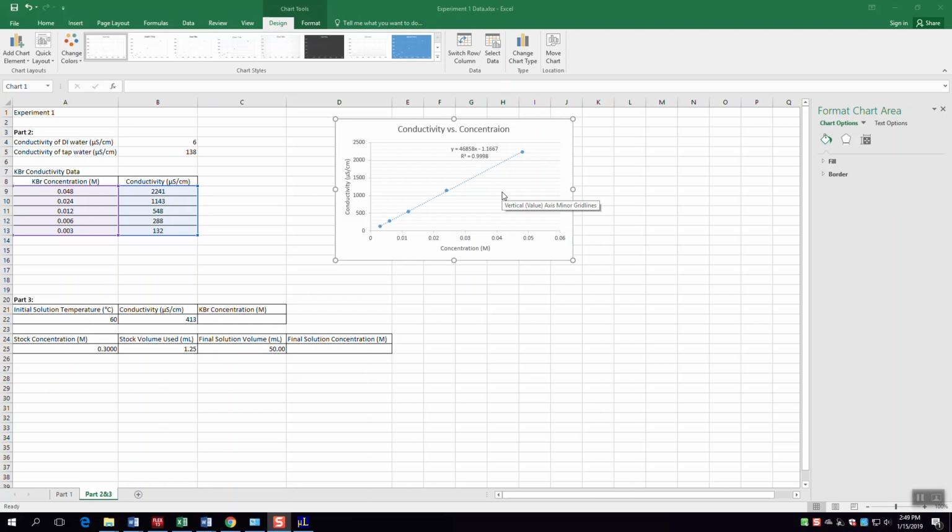If that happens, all you need to do is go back to your stock solution, remake that particular solution, and remeasure the value. This could fix your data and make your life much easier when you're writing your conclusion later. This is a reason that it's really important not to get rid of any of your solutions until you're fully completed with the experiment. If you took Gen Chem here, you'll know that we said that to you repeatedly then, and it's still true now, and it'll hold true through your entire scientific career, that you should never get rid of anything that might be useful in the future. So please make sure your data is good, and don't dispose of your solutions until you have confirmed that.